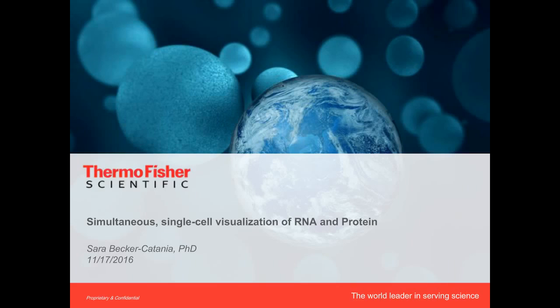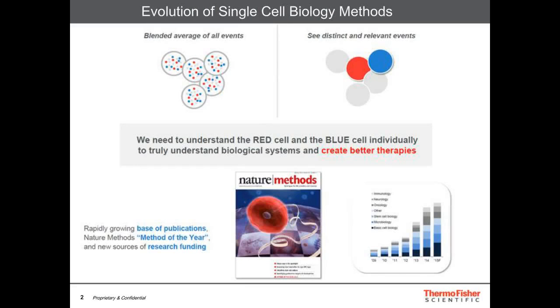Thank you, Judy and LabRoots, for the opportunity to speak today about the development of a new assay that allows us to look at visualizing RNA and protein in single cells. Cellular heterogeneity is present in any biological sample, whether it be at the level of gene expression, protein, or differences in post-translational modifications. Most of our understanding of gene and protein expression has been from methods that really look at entire populations and give an average result.